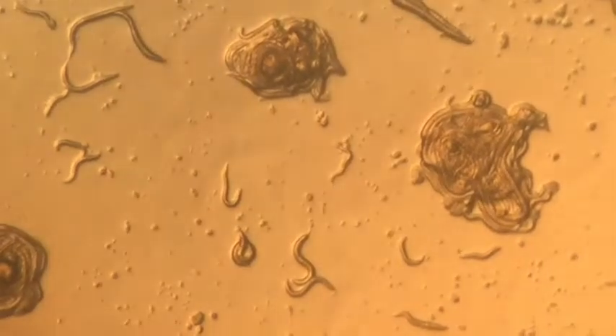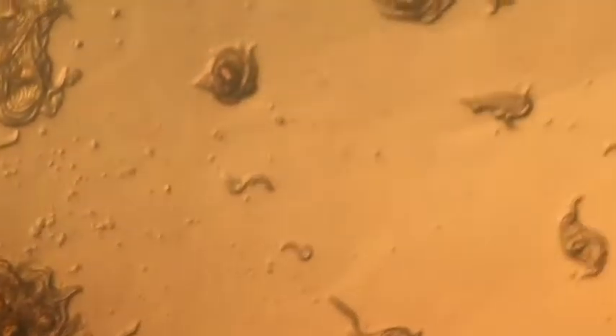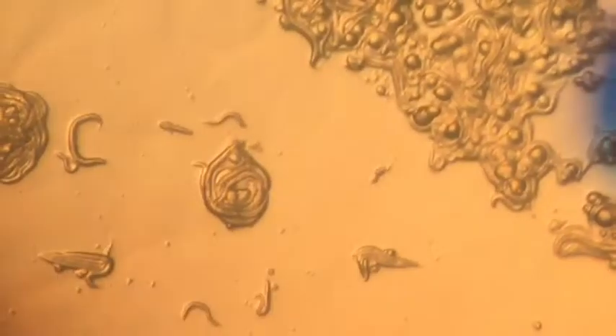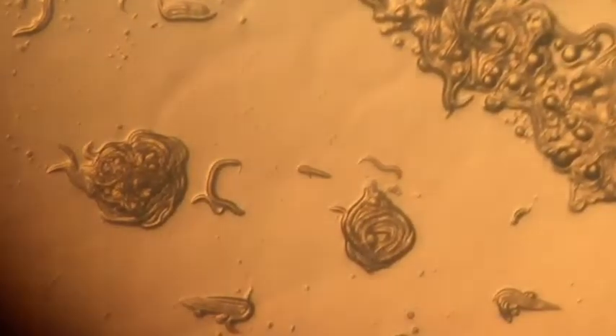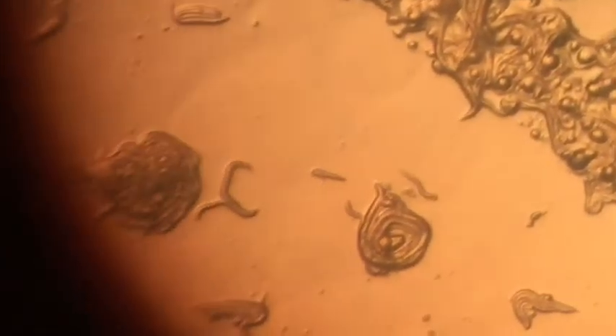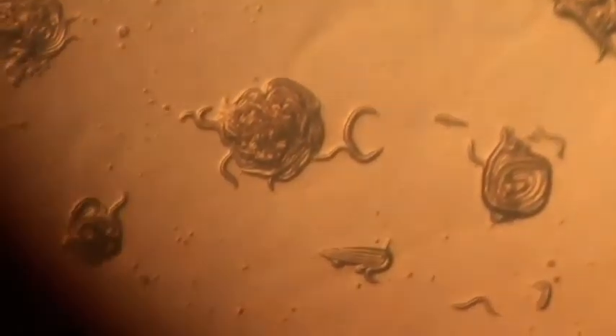This video is of the ROL-6 gene. This is what our C. elegans mutation was originally supposed to look like. This mutation causes the C. elegans to move in a C formation rather than an S formation. This occurs within the neurotransmitters in the C. elegans. As you can see, these C. elegans all cluster and huddle together in several large groups.